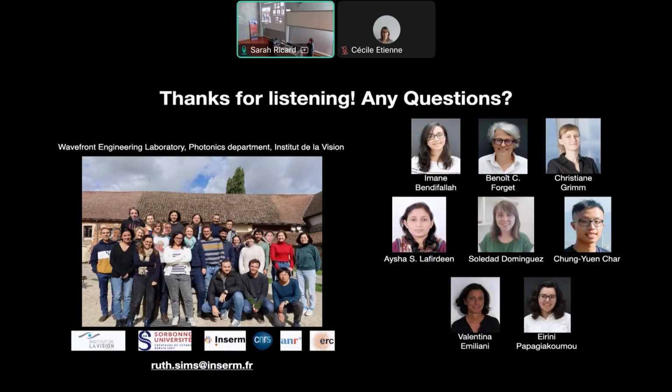Not directly, but indirectly, I would say. For instance, there's a lot of cleaning of data sets that is actually part of the network, for instance denoising. And that is universally helpful in microscopy, whatever the problem. So it's part of it, yes. Thank you.